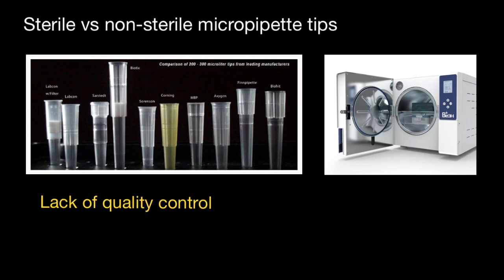Tip manufacturers validate their sterilization process and perform regular quality checks. In contrast, individual labs don't usually test the effectiveness of their autoclaving process, which can lead to contaminated samples.